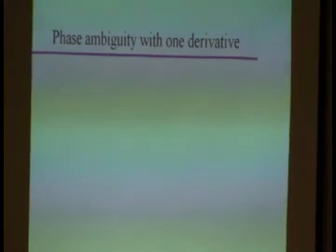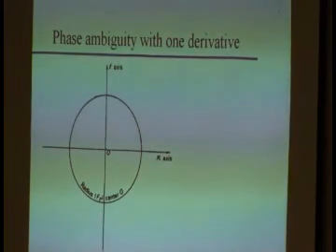So what can you do? Well, you can actually do a little drawing. Real and imaginary axis, Argand vector diagrams should look familiar by now. And you draw a circle around 0 that has a radius of Fp. Because you know what the magnitude, the structure factor magnitude of your native protein is for that reflection, right?